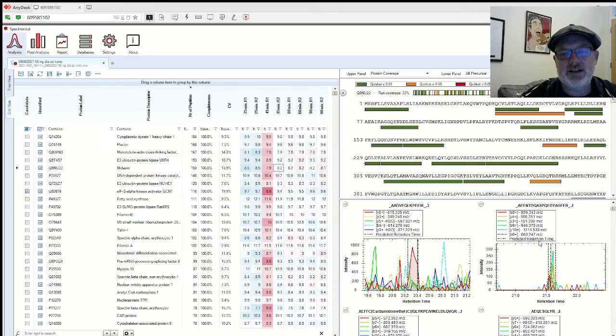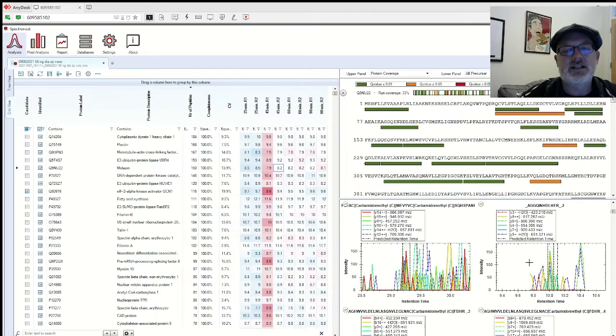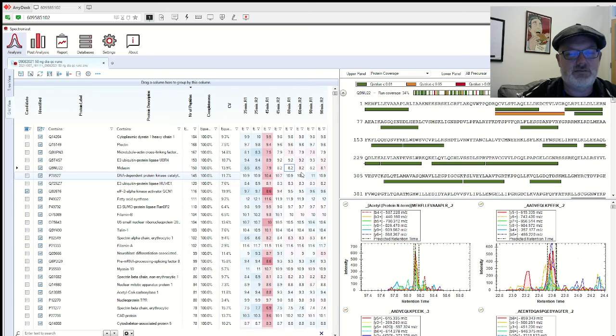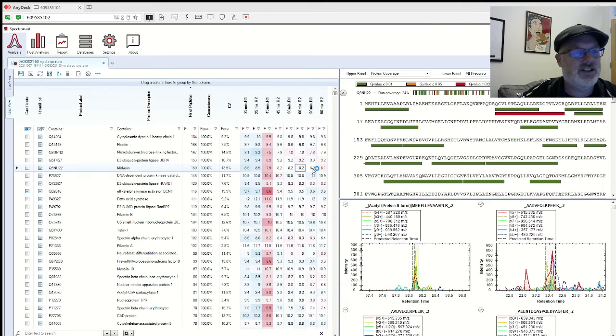This one looked a lot better, and I'll show you what good data should look like. Some of the data might look like this. That might be because we have imputation turned on, and I will show you how to turn that off and what that means. In one of these videos, there'll probably be about 4 of these videos.